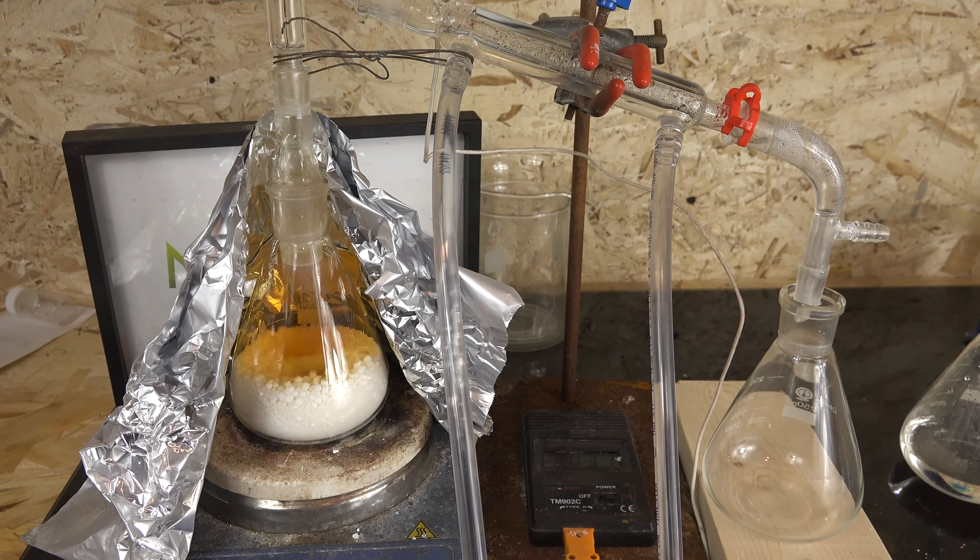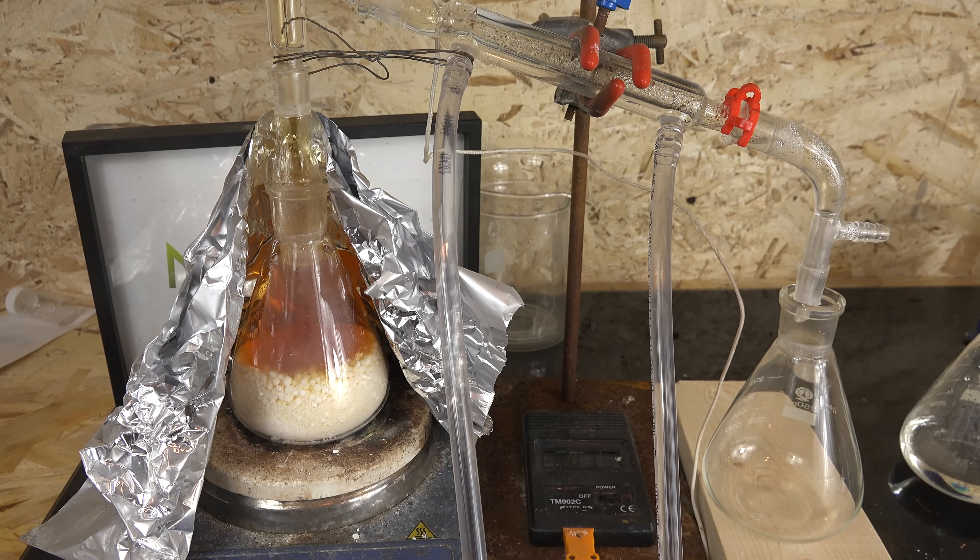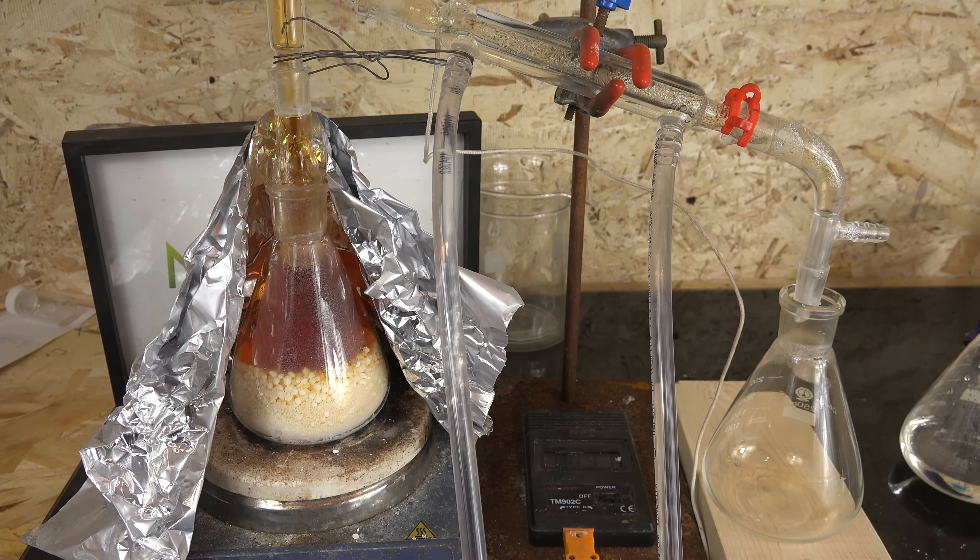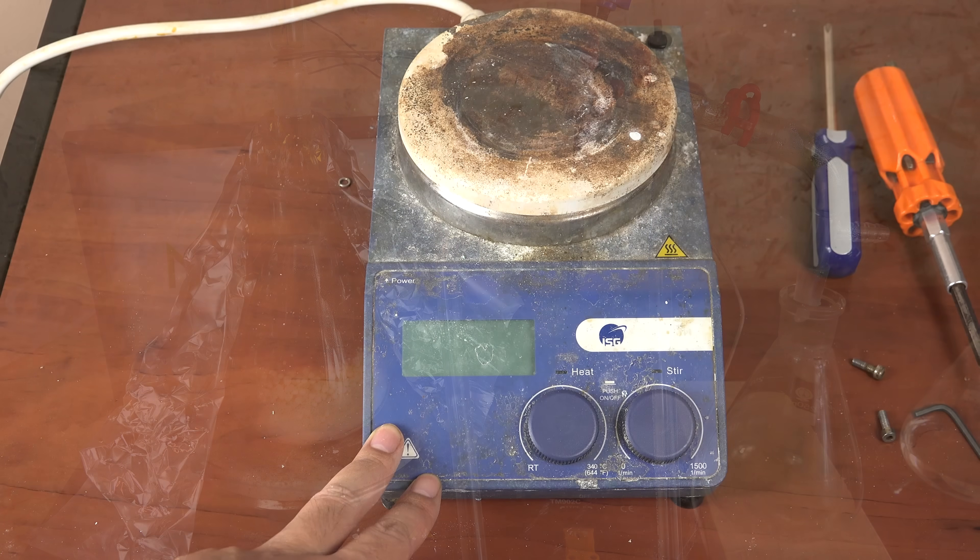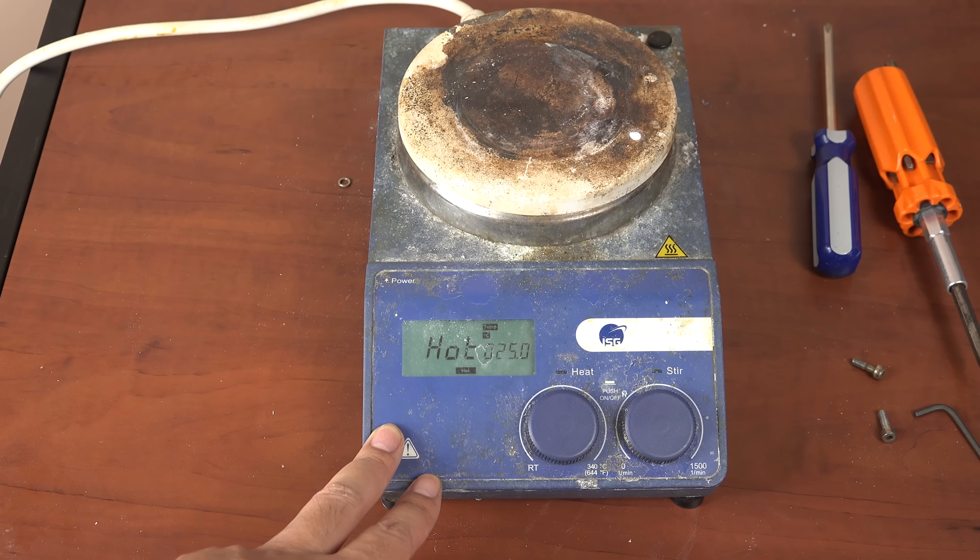So that was my research so far in making nitric acid. I'm hoping to remake my complete guide to nitric acid as the old one from 10 years ago is no longer up to modern standards. Anyway, I wanted to go further but I was stopped by a breakdown in a critical piece of equipment. My hot plate stirrer stopped working.